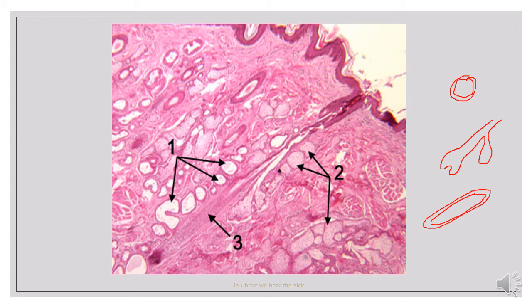Depending on how they lay when the tissue was sectioned, if the follicle laid in a longitudinal plane, it will appear elongated, just like what we are seeing here. If it laid in a transverse plane, it appears round. And if it laid in a slant plane, it appears oval or slanted. So any of these three planes of appearance still represents the hair follicle.